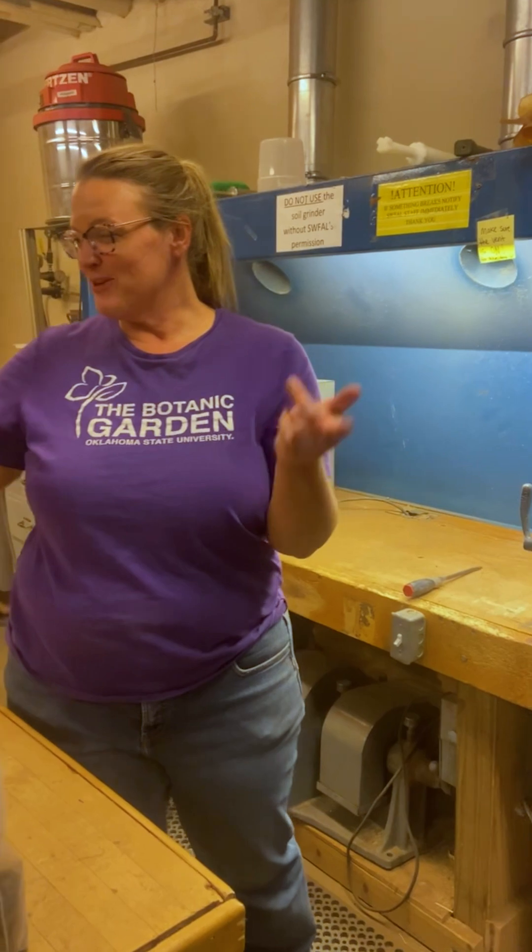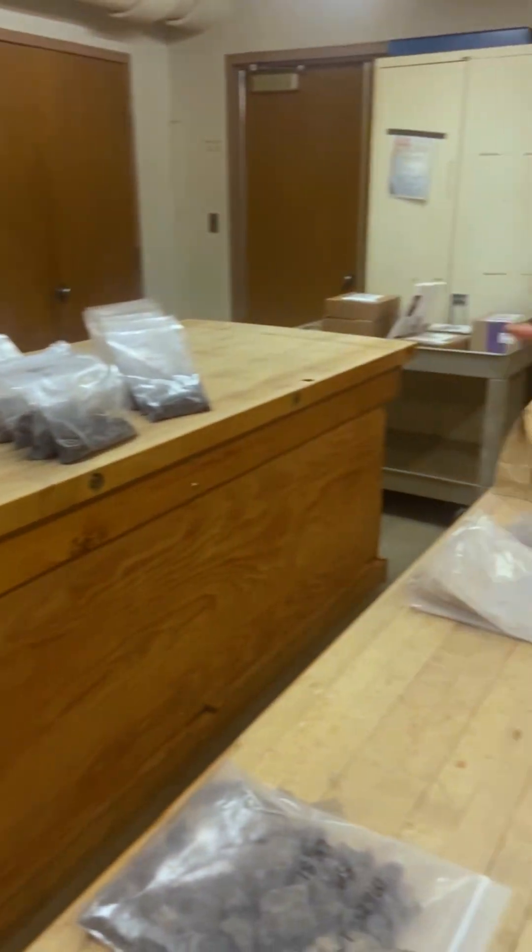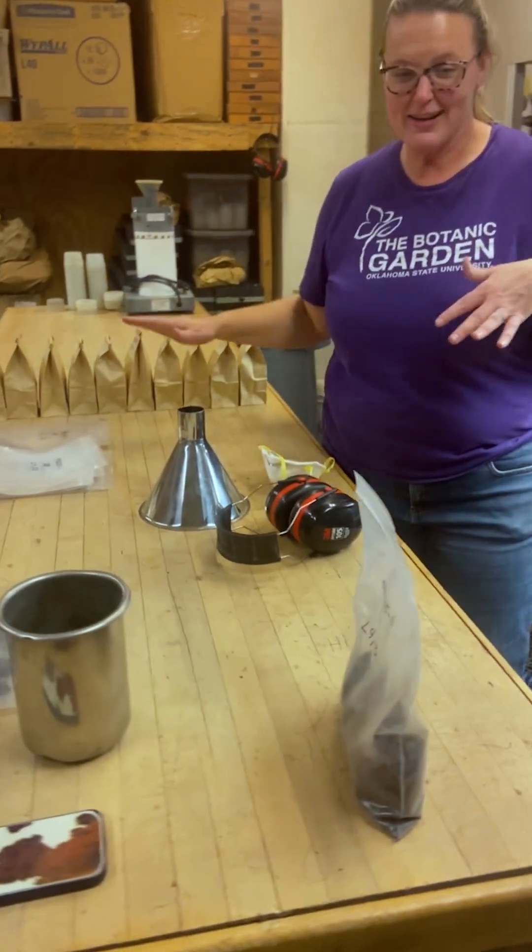If we come over here, we've got several of our soil samples. These are the ones that we have to grind.